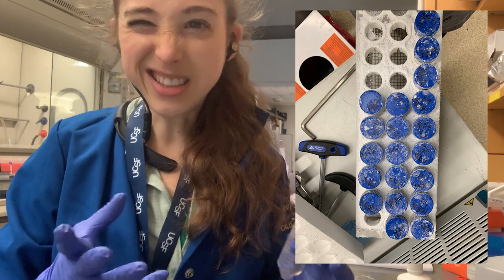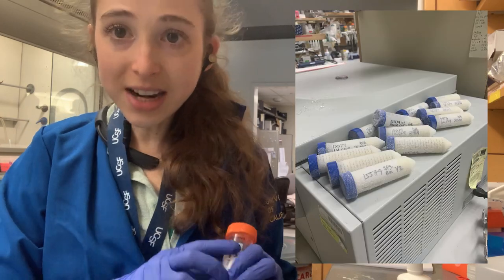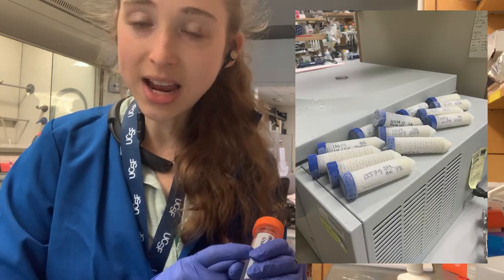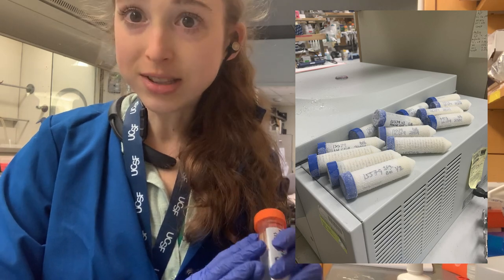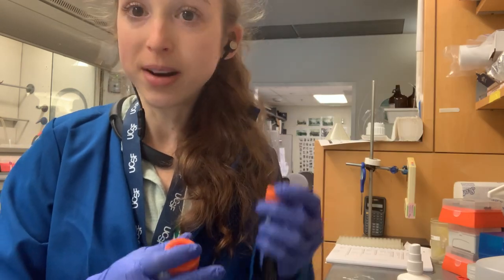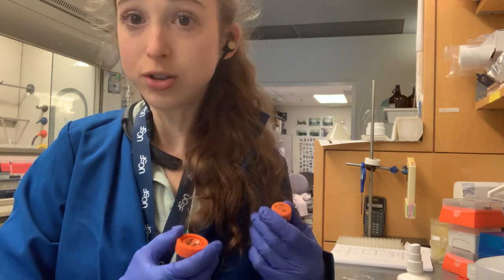Basically just what the protein is inside of it. On the side of the tube, I'll put more information including the date, the cell type, any other notes. You can't fit all that on the top of the tube, but on the top of the tube, you want to use what's most important for you.